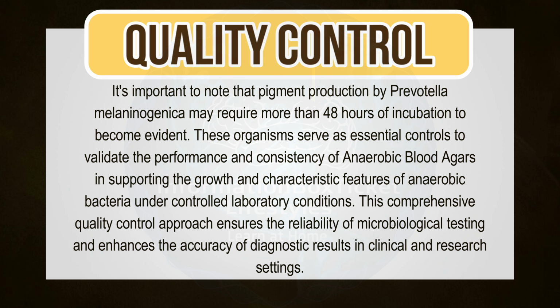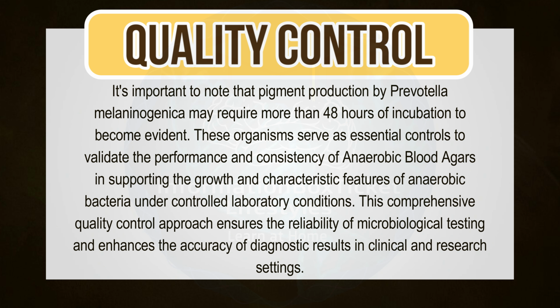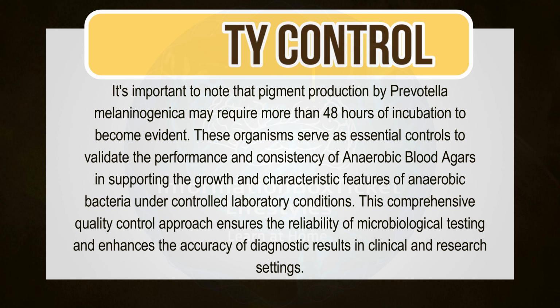It's important to note that pigment production by Prevotella melaninogenica may require more than 48 hours of incubation to become evident. These organisms serve as essential controls to validate the performance and consistency of anaerobic blood agars in supporting the growth and characteristic features of anaerobic bacteria under controlled laboratory conditions. This comprehensive quality control approach ensures the reliability of microbiological testing and enhances the accuracy of diagnostic results in clinical and research settings.